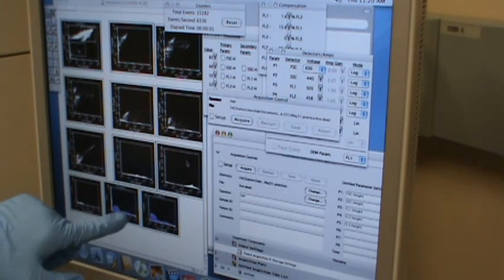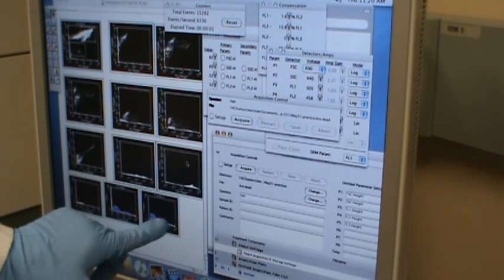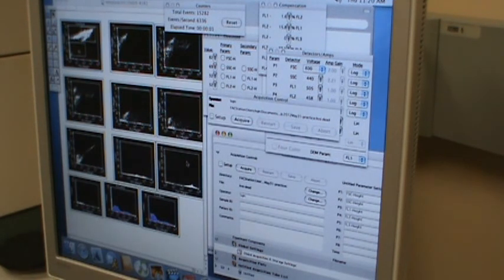If you look at this peak, it's a broader peak now, and hopefully when we switch to the dead cell, we see a stronger peak there. Okay, I'm trying to keep track of the sample. Try to vortex the sample before you measure it. If you don't, you may have 2 cells stuck together. If both of them are dead, it's okay. If one is dead and the other is alive, it'll give you an average signal. That's kind of confusing. So for this one again, I'll try to do it as quickly as possible.